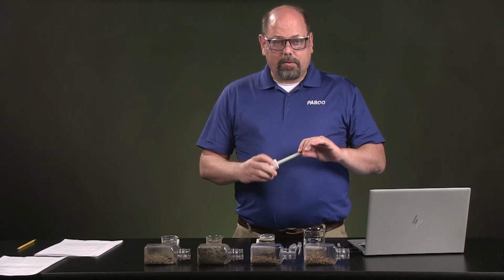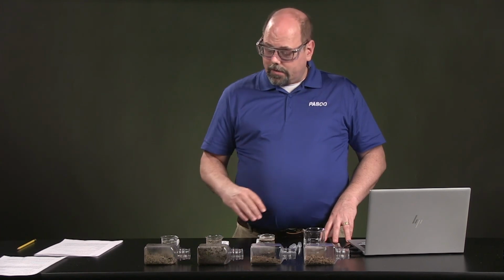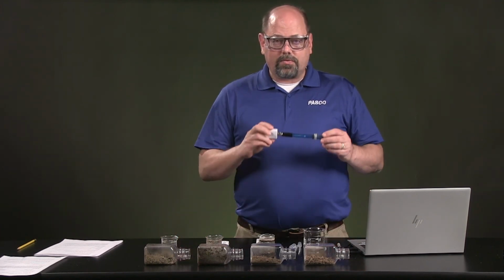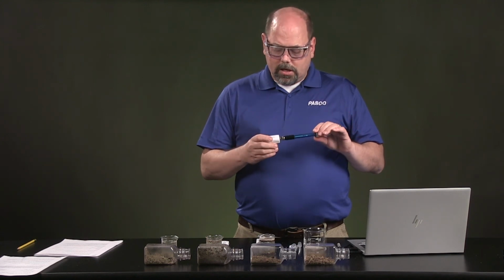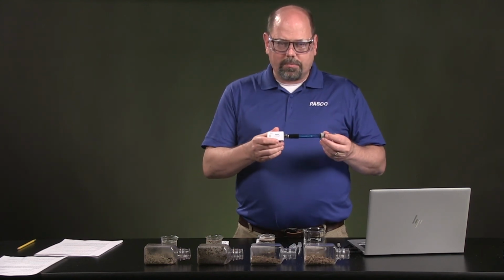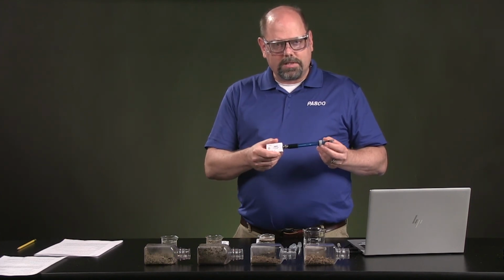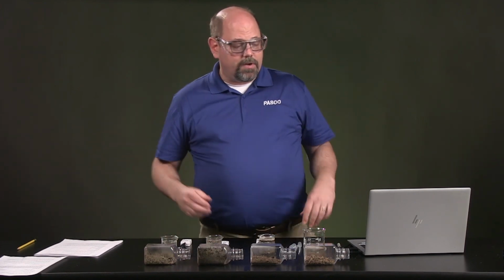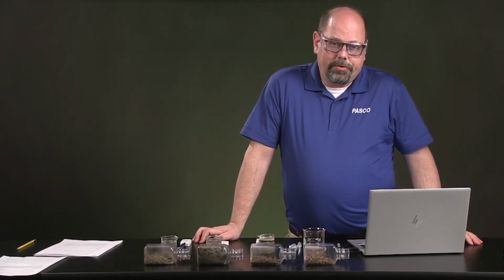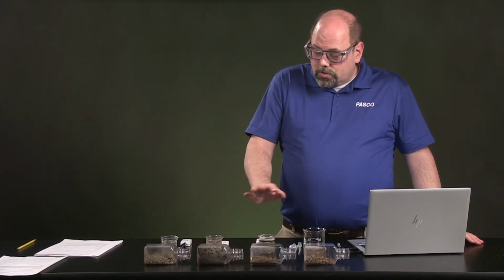We've got the conductivity, which is going to tell us a little bit about what kinds of minerals dissolve that are in that area. And the last one is the healthiness for plants and things that live there, for young especially, young bug eggs or something like that will be affected by pH. So the farther we get away from neutral water, 7, the less likely that can really foster a rich biological community inside your soil.